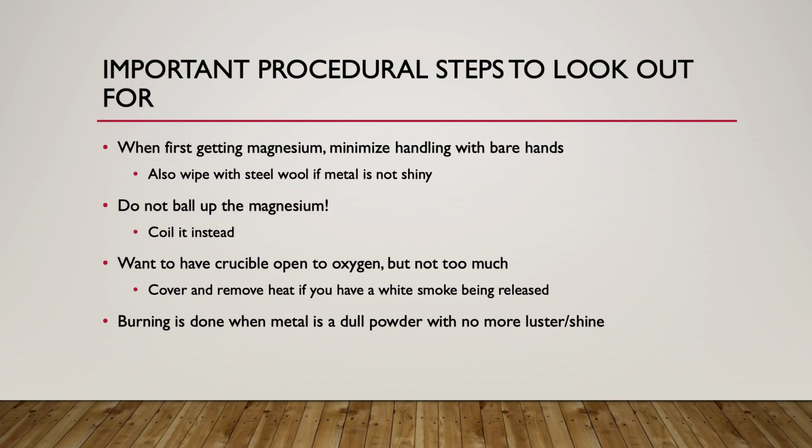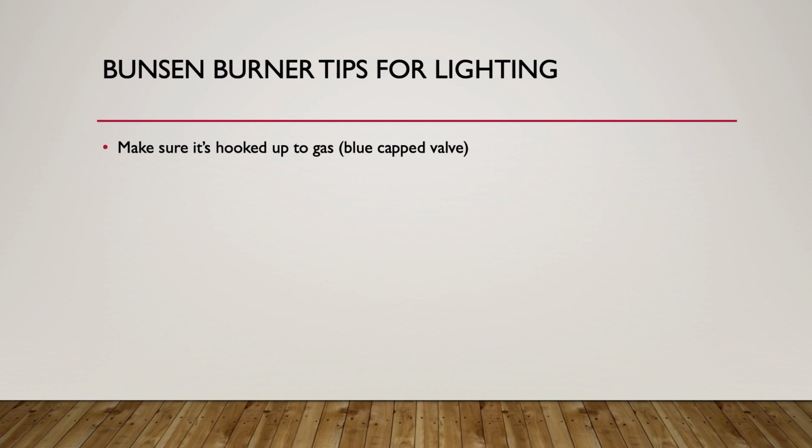You can also, if you're still heating it, if you've opened the crucible fairly significantly and there's no white smoke or anything coming off as it's heating and all you see is maybe a dull red glow, then at that point it should have been pretty much all the way burned and hopefully converted to magnesium oxide, or magnesium nitride also is a possibility.